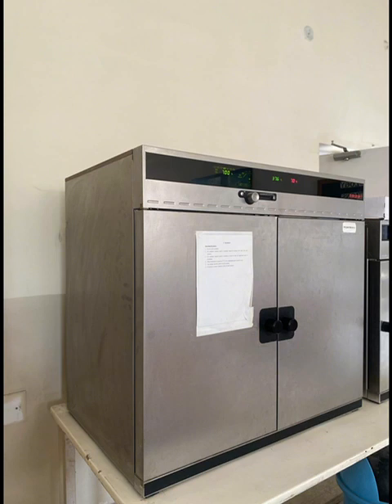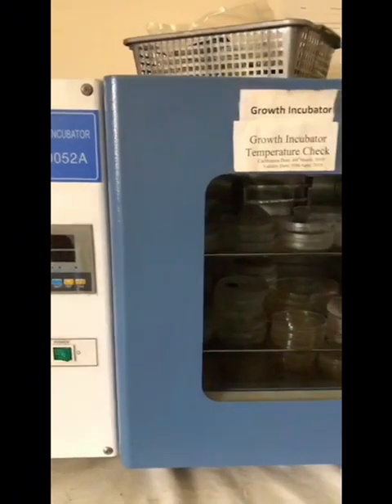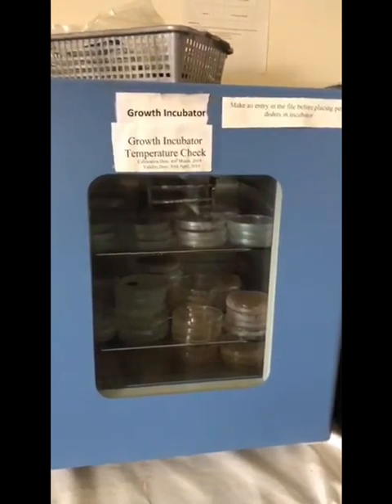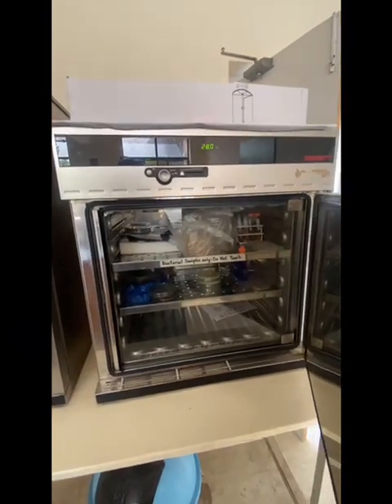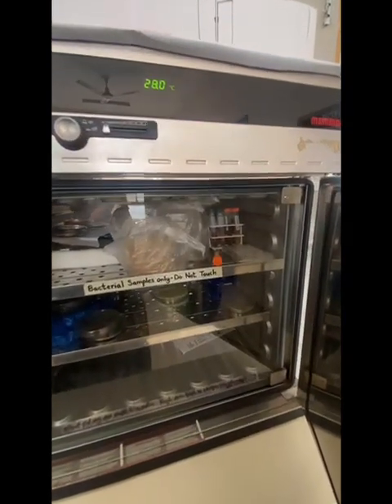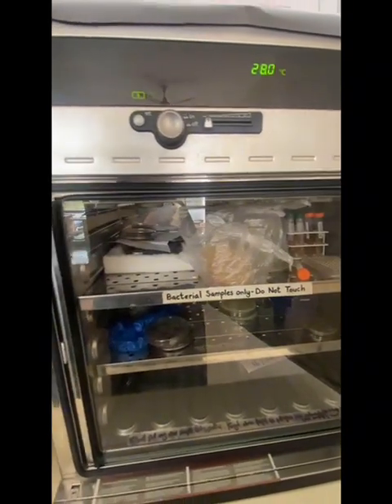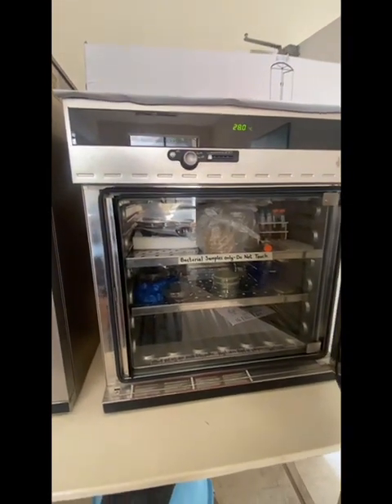A growth incubator used in laboratories, often referred to as a microbiological or CO2 incubator, serves a specific purpose in facilitating the growth of microorganisms or cell cultures under controlled conditions. Laboratory growth incubators provide a controlled environment for the growth and cultivation of microorganisms, cell cultures, tissues, and other biological samples. They maintain specific conditions such as temperature, humidity, and gas composition to support optimal growth.